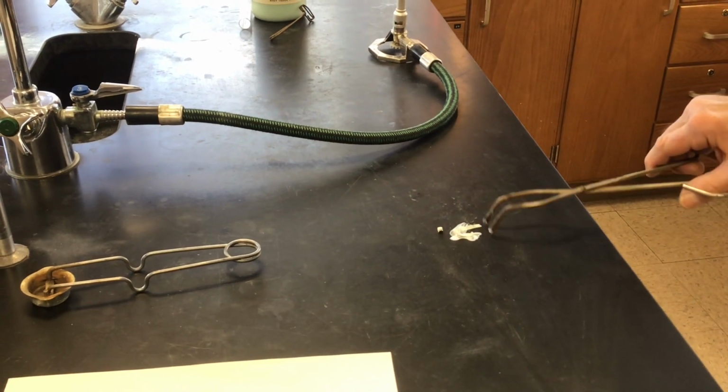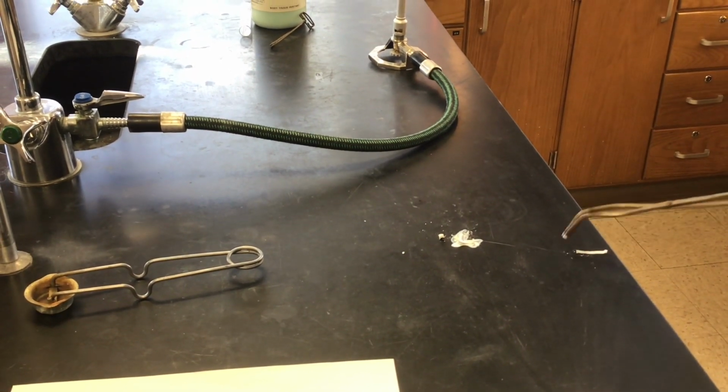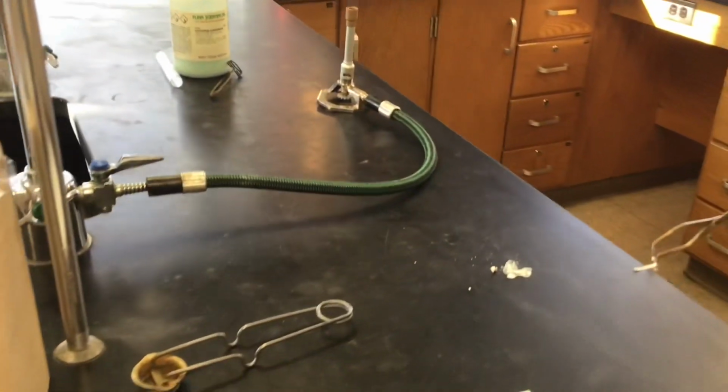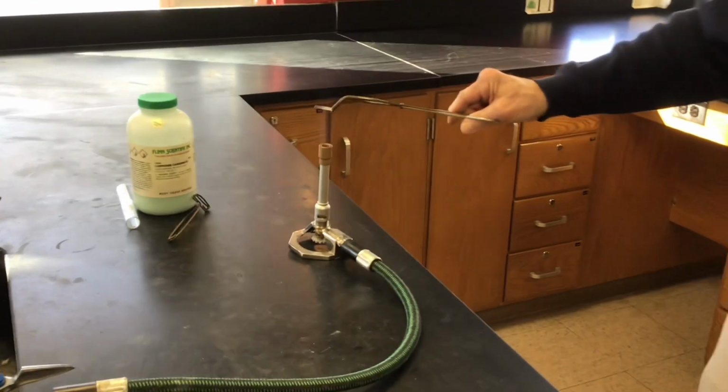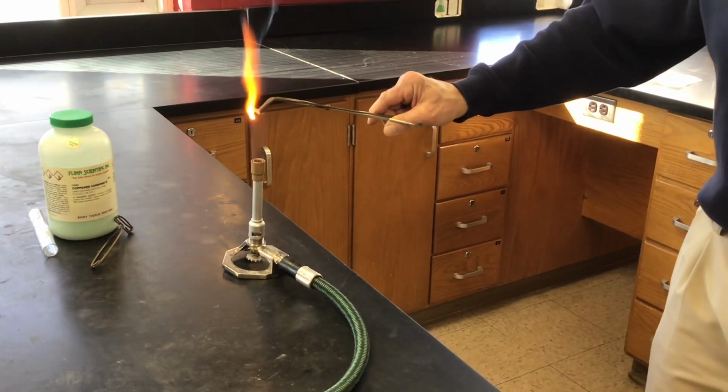There's still quite a bit of magnesium left. It didn't react. There we go.